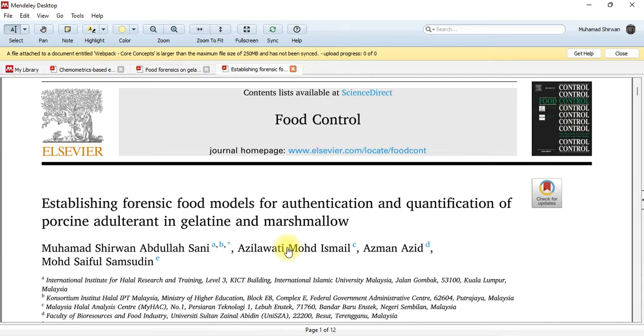No, sometimes perhaps 3 fish, but more repetition. Same samples. And sometimes there are some fish yang macam catfish. Ada some fish with their scales dengan sisik. Dia kan different group kan. So this fish with scale dia akan repeat 40 kali. This fish macam catfish, ikan haruan ke apa, so on and so forth, dia akan repeat 40 times as well. Dia pun buat macam tu.